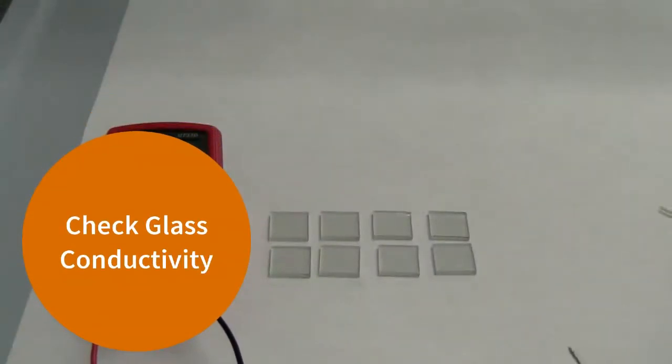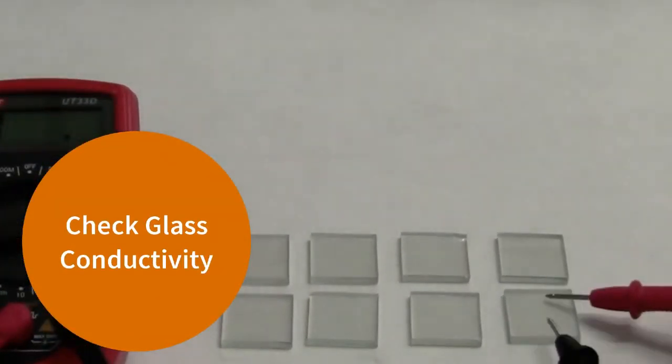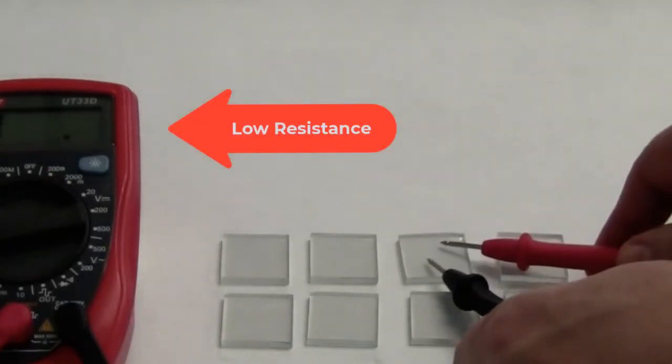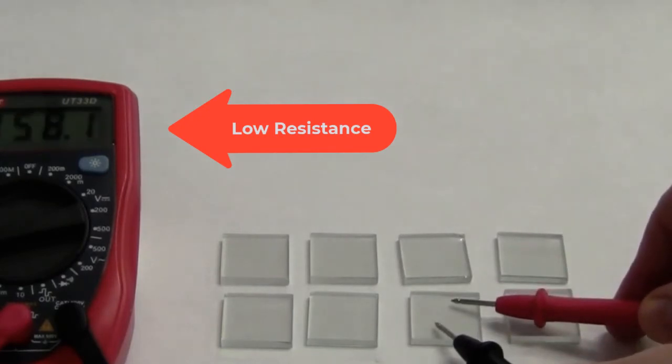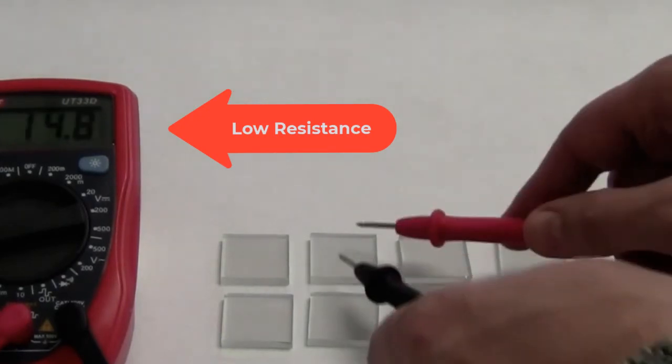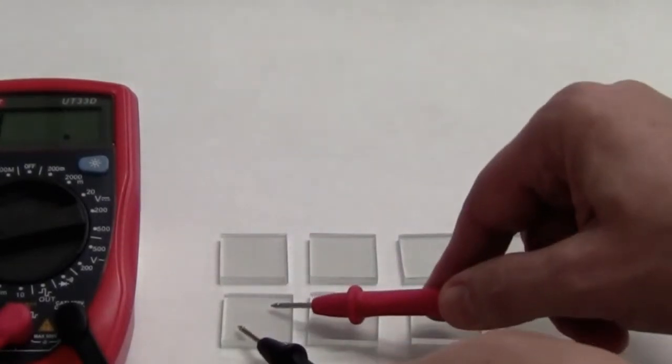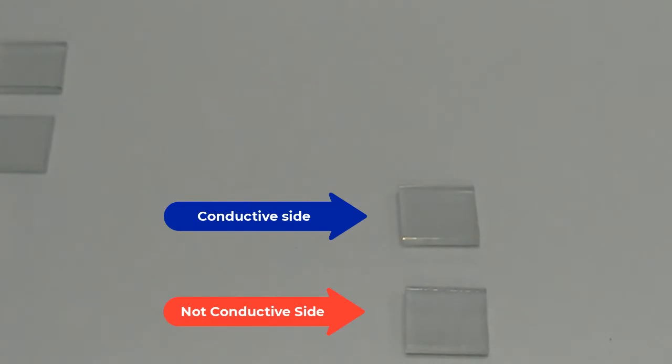We can check the conductivity of those glasses before preparing them for the deposition of titania. We can see that they are all conducting on the sides exposed to the air. After having checked the conductivity of those glasses, we can put them in this way on the desk. We will have to switch the side of the lowest glasses because this will be only used to support the deposition.